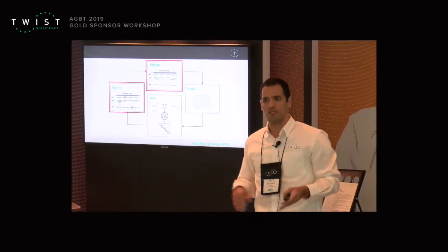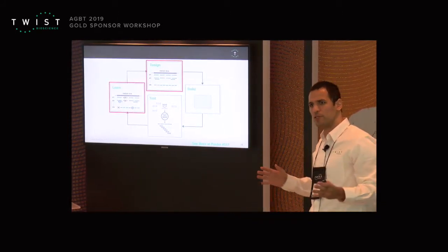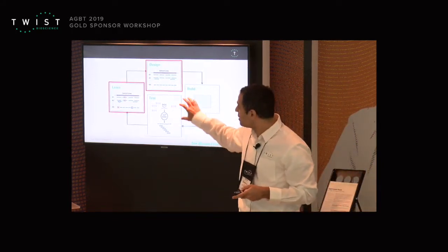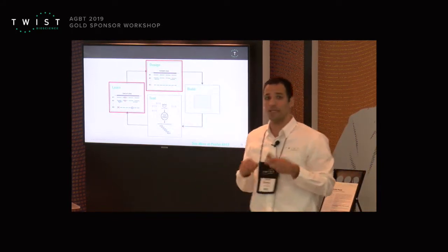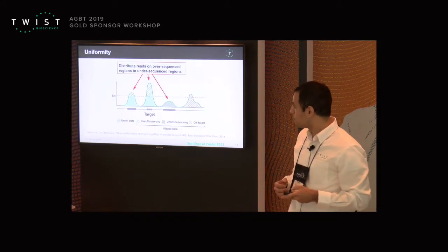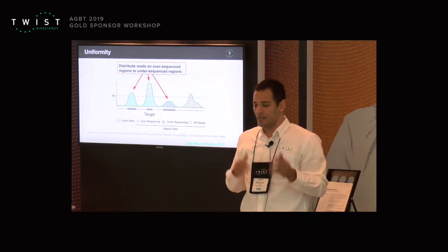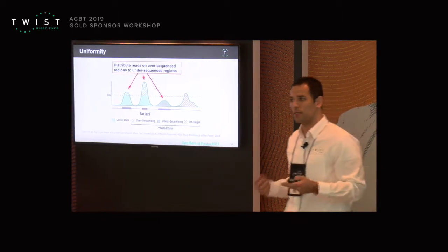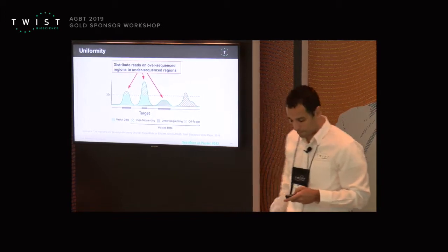So we have build and test down. We can do it really well. We can make an exome. We can iterate on that, and we have done that. All that infrastructure that we have here is leading into our design and learn steps. We've done a lot of learning and designing based on that, and I'll give you a flavor of 3 of the things we've done just so you get an idea of how we think about this problem.